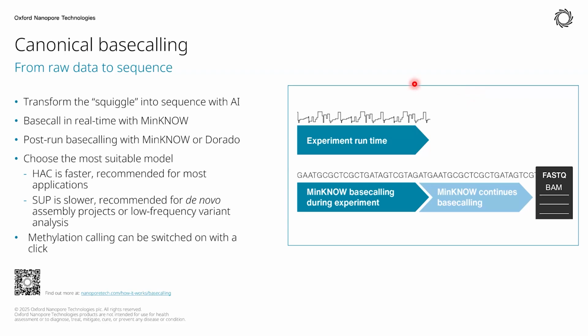And the base caller is integrated within MinKNOW, and can carry out base calling live during the run, after a run has finished, or a combination of the two.